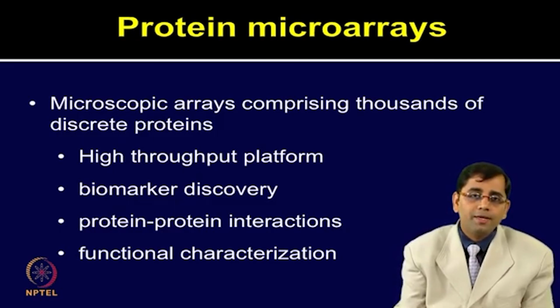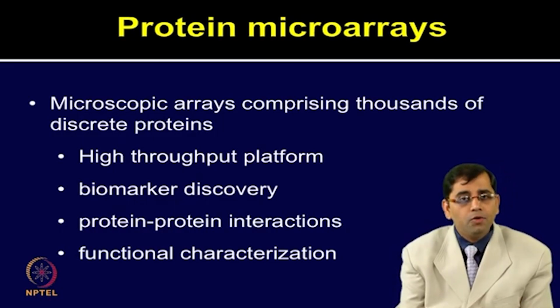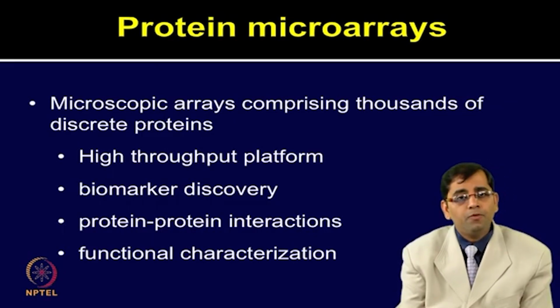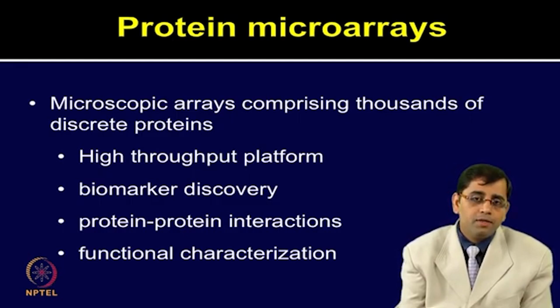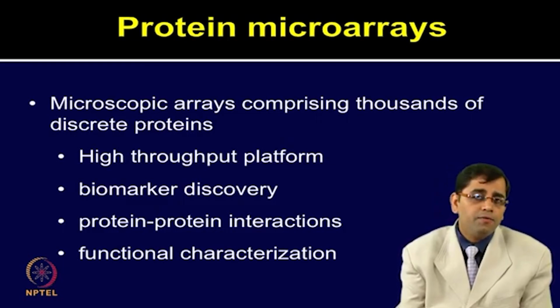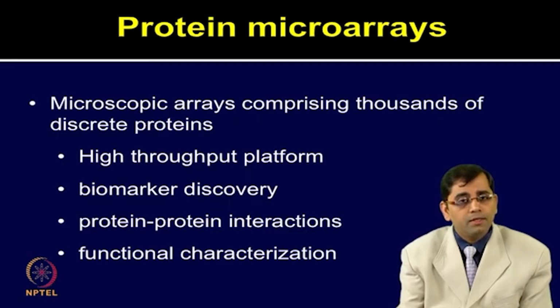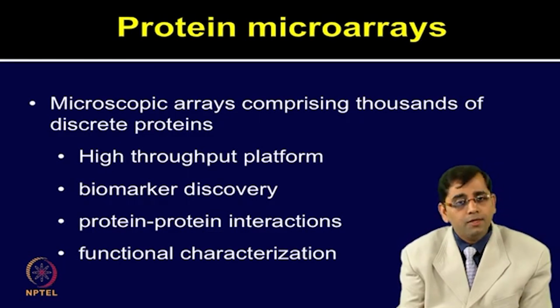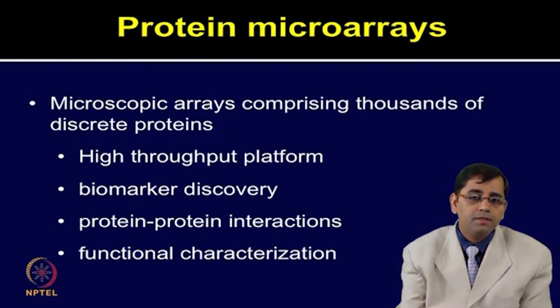Now the concept of microarrays has stirred a great deal of excitement in the proteomics community because it can be applied for several applications such as biomarker discovery, protein-protein interactions, functional characterization of proteins, identification of substrates, drug inhibitor studies, etc. Once the protein microarray technology is fully realized, it promises to enable the study of a broad variety of protein features at an unprecedented pace and scale.